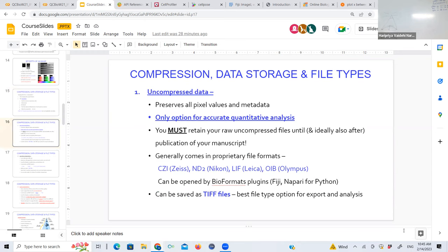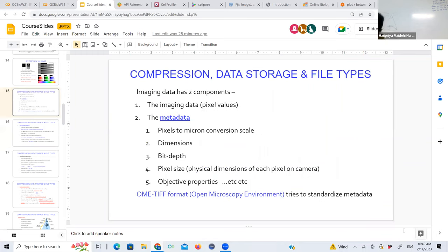And these are also things that you build into your microscope control software. So it's usually just auto-filled. You don't have to do anything for it. And Fiji, for example, has plugins that are able to read OME-TIFF, so you'll be able to get your microscope properties out of it. Scikit-Image, I don't think, has a plugin to read that.